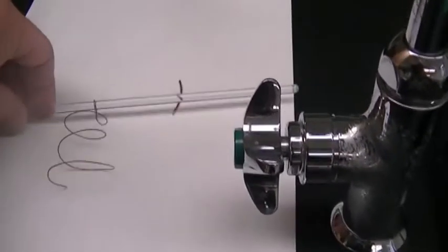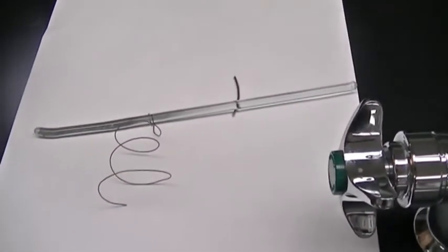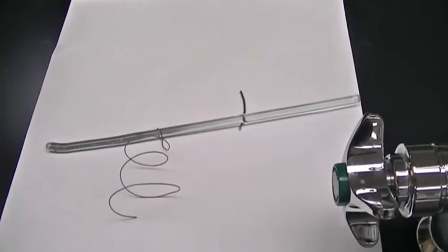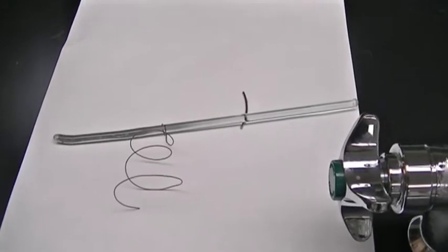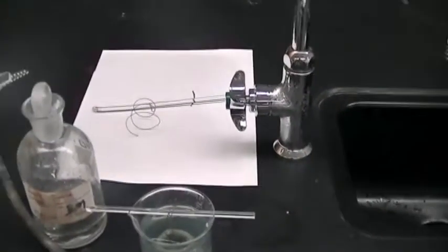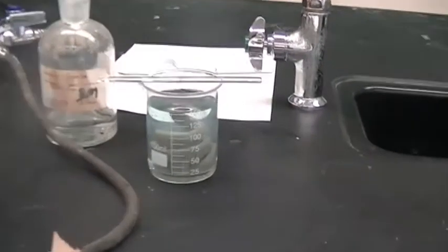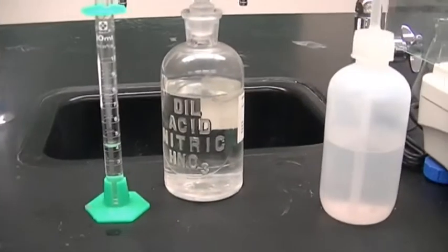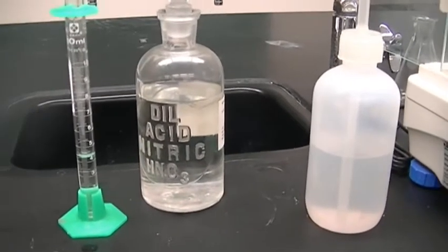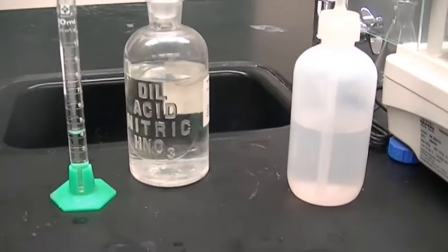And then it says to make a copper coil, and so I made a copper coil. This is done usually near Christmas time, and so we're going to make our silver Christmas tree, is what I would normally say. Alright, so then you dissolved your alloy in the nitric acid. And then it turned a blue solution, which indicates it probably has some copper in it.